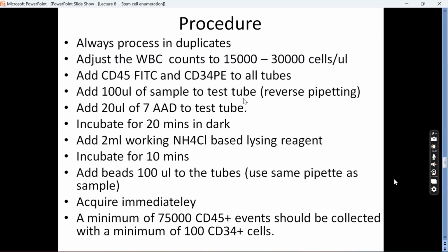And if you give more pressure, it will still go in. That is called a hard press. So first press will be a soft press. Then if you give more pressure on the thumb, it will again go in. That is called second press.